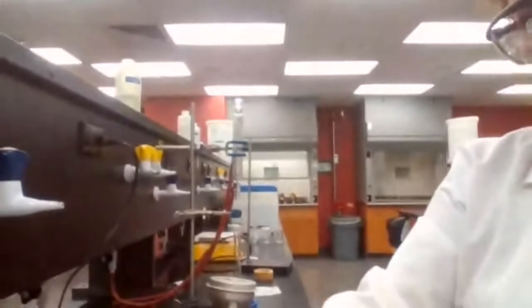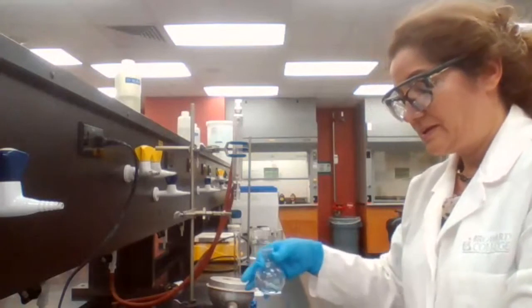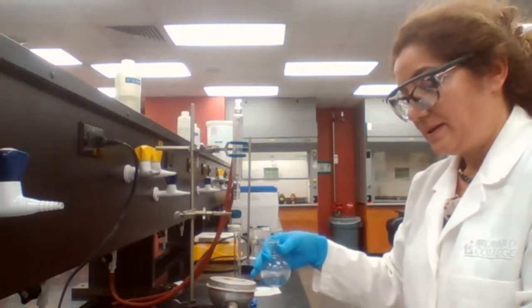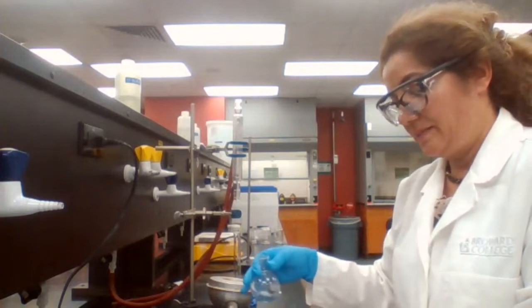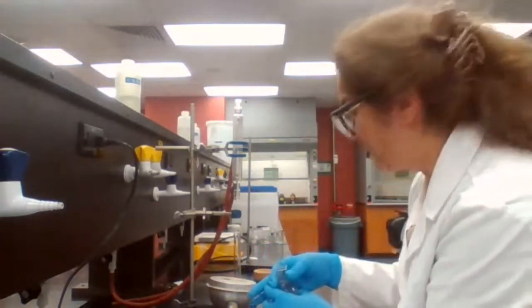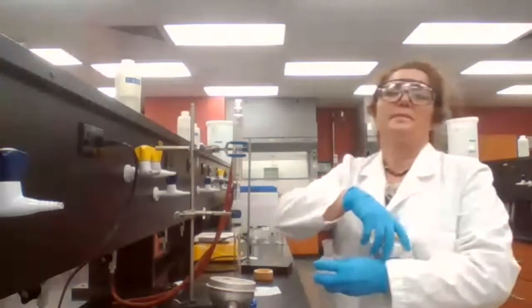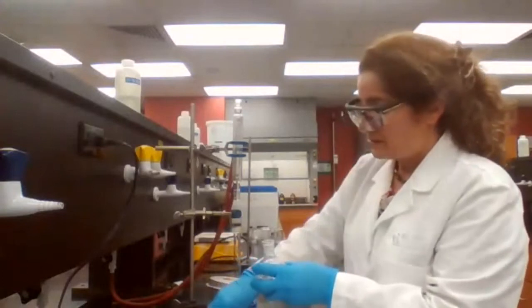So back to our workstation. We need to check the procedure with you to make sure we are doing everything correctly. So pouring slowly down the walls, let it cool before, mix it, and reflux. Is boiling chips mentioned there, or do we understand from the last experiment that we have to do reflux? Yes, boiling chips is there. Okay, even if it's not there, we have to add the boiling chips. They are mentioned? Okay, good.